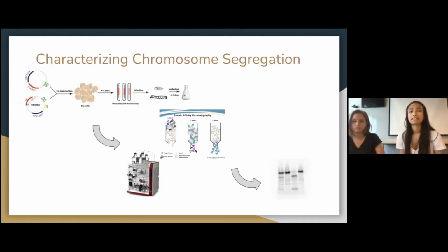Basically this expression system exploits viruses. Viruses are dangerous and harmful to us and our cells because they're able to hijack our cells' machinery to produce in mass their own proteins. We've been able to use that to our advantage by using molecular cloning to incorporate genes that encode for the proteins that we want into the viral DNA. Then we're able to infect insect cells with these viruses that are coding for the proteins that we want, so that the viruses in those insect cells will mass produce those proteins.